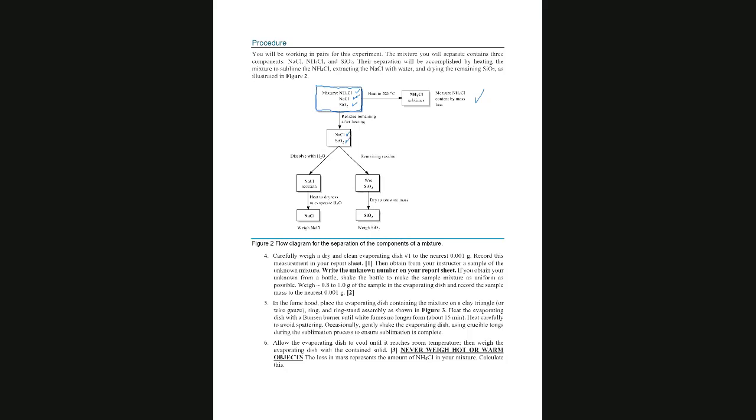Now we say, oh, how are we going to separate those two? Well, we know the physical properties. We know that sodium chloride is soluble in water and sand is not. So we add water. Here it says dissolve with water. And when we add water, we are going to have here a little beaker.